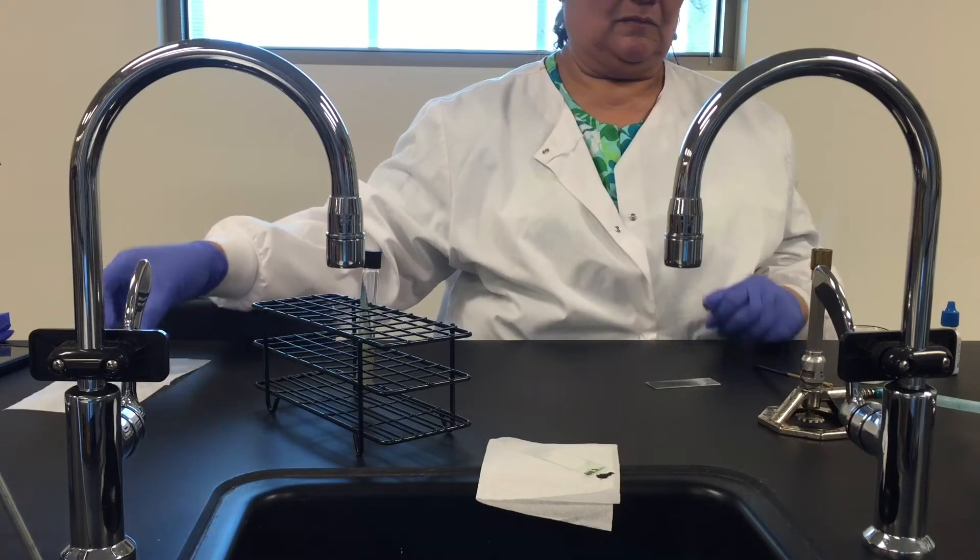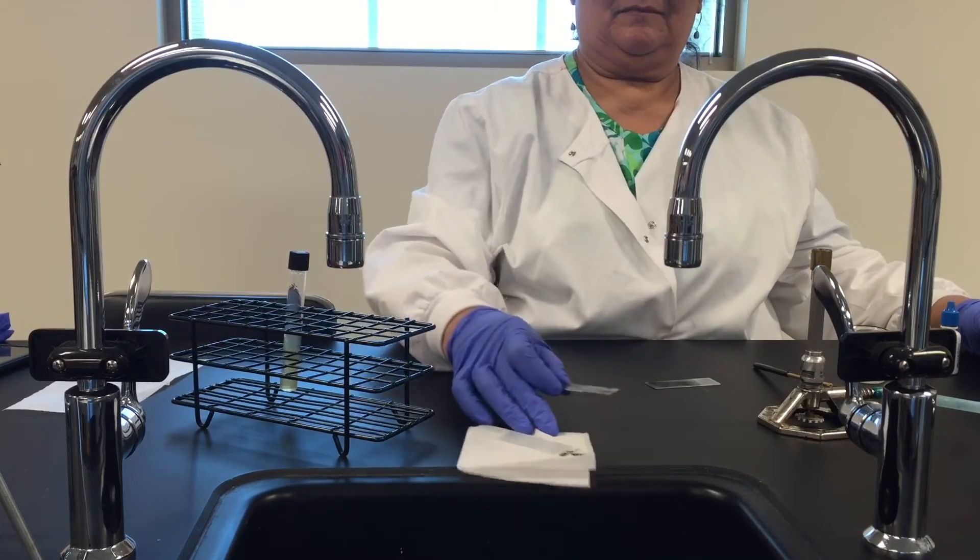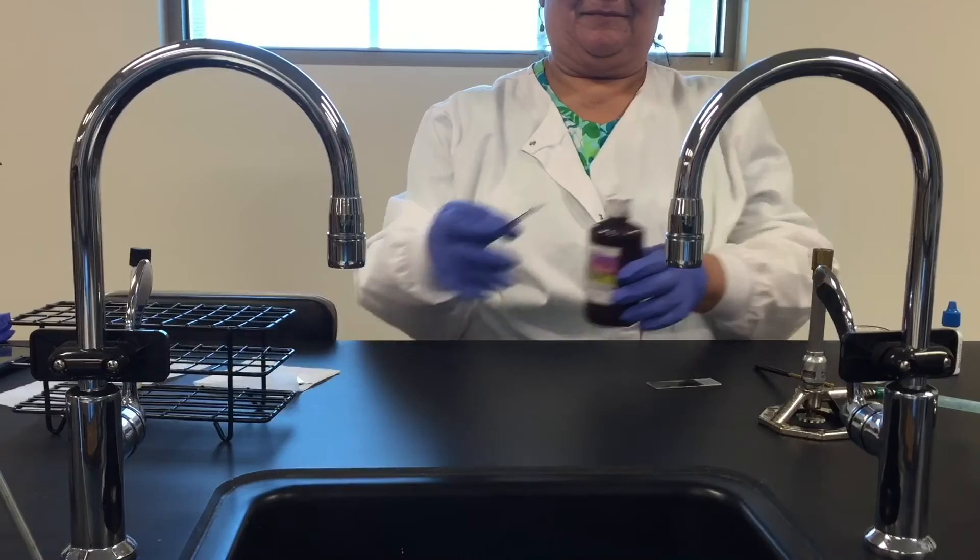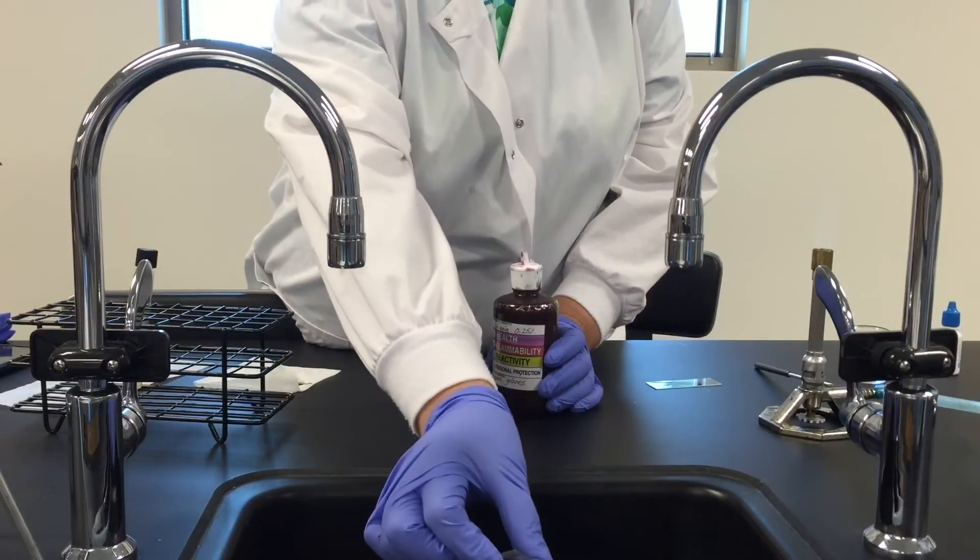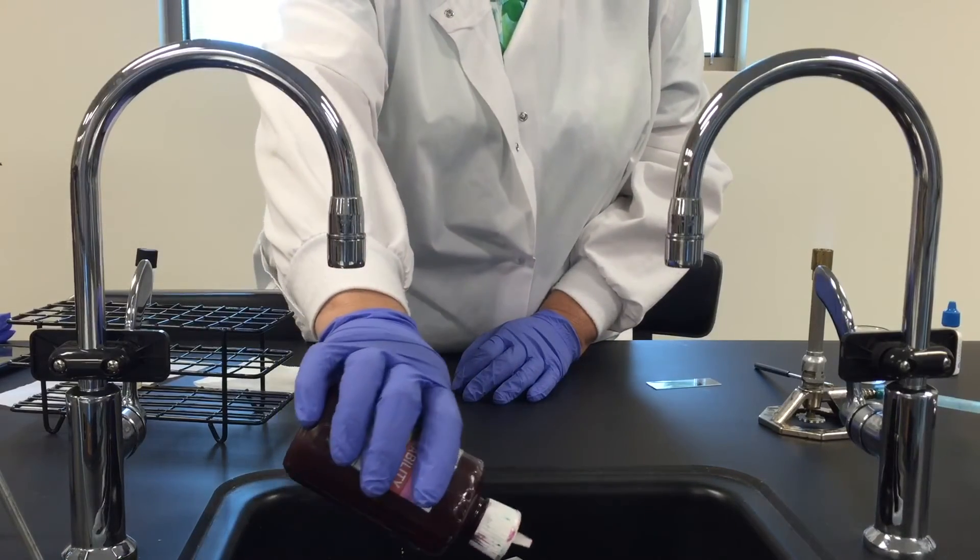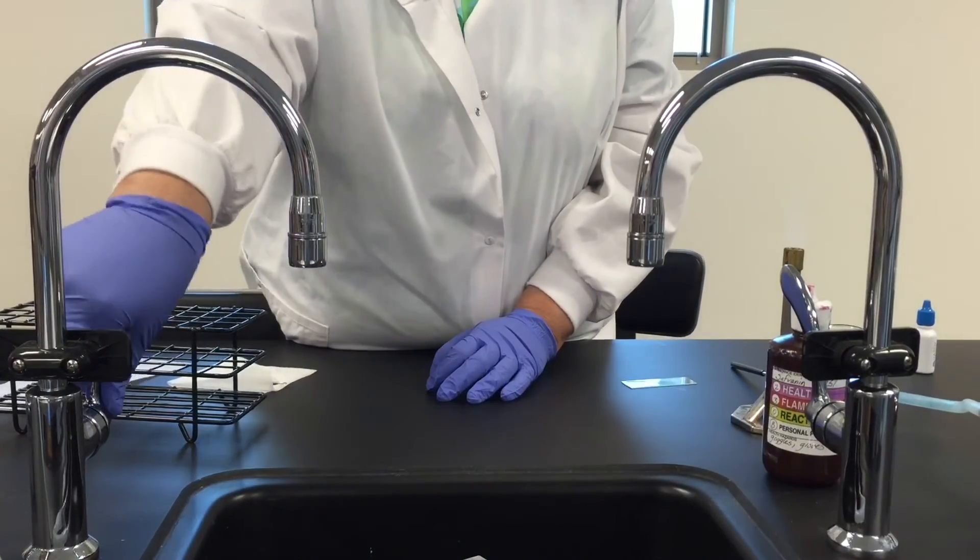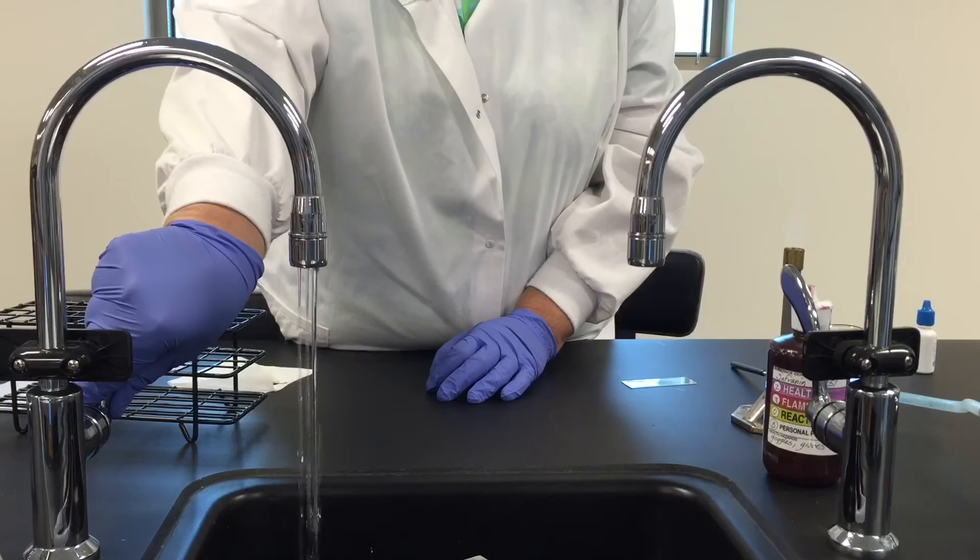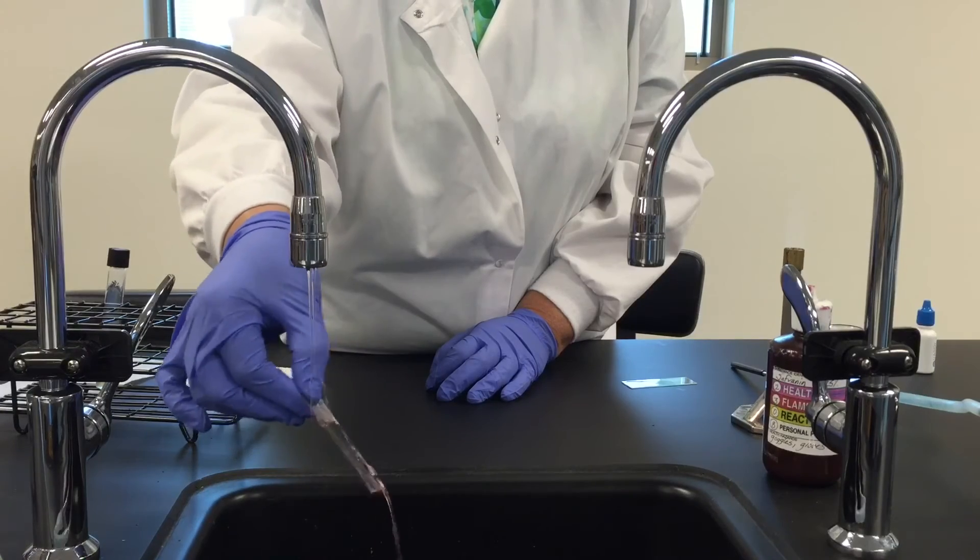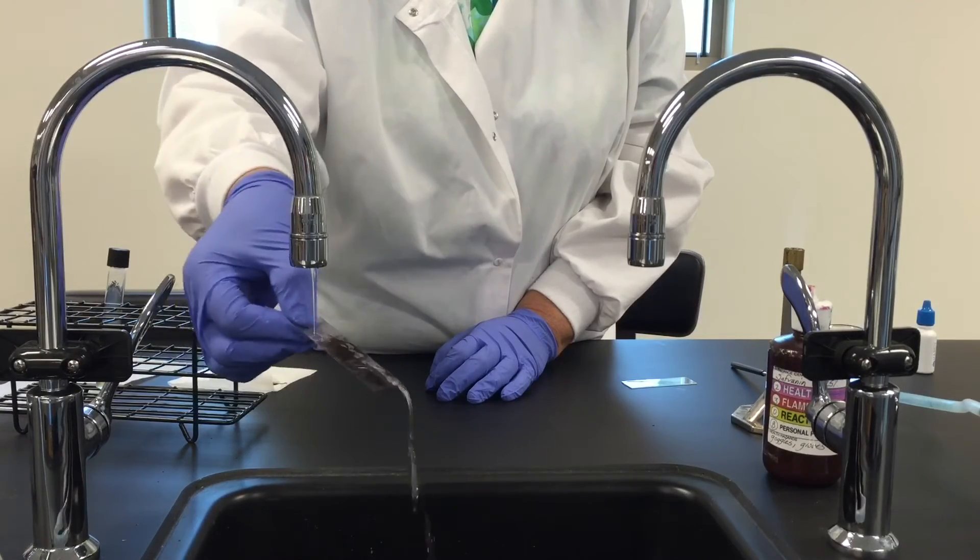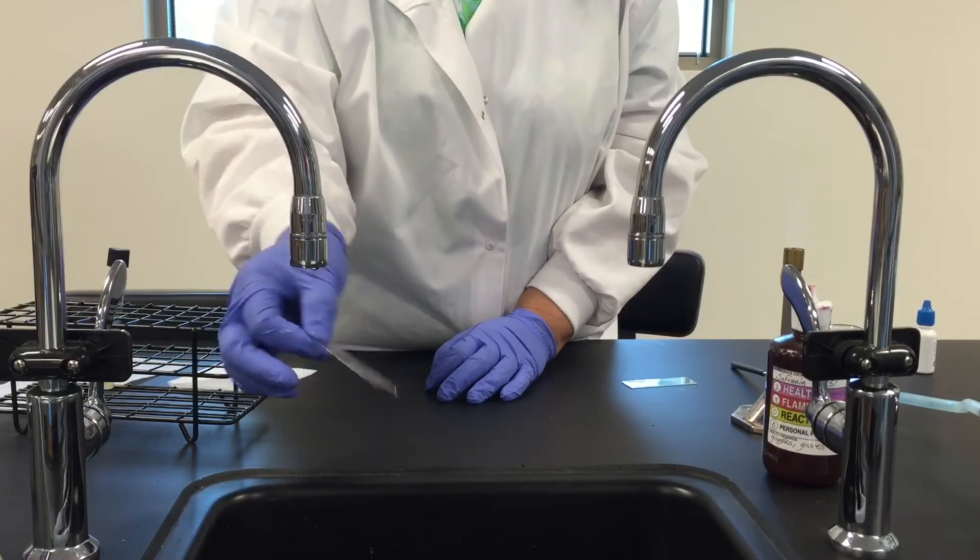Then we are going to take the slide and put it on a staining rack over the sink and we're going to cover it with safranin. We'll leave the safranin on for a minute. Then we'll pick the slides up one at a time, give them a quick rinse. You can use your clothes pin for that or just do it by hand like Renee is doing. Blot them dry with your bibulus paper and you're ready to view.